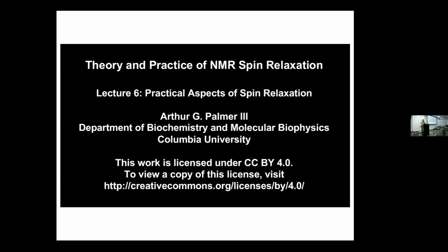And for example, for a lot of the backbone triple resonance experiments, for a protein, the critical hydrogen to deuterate is the alpha hydrogen, because that dipole interaction just causes all C alpha magnetization to relax very quickly.